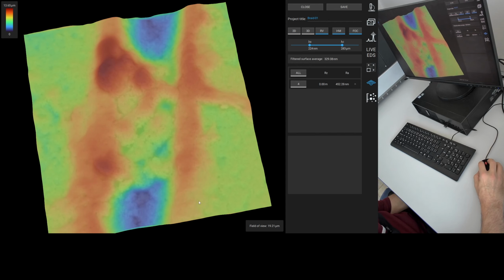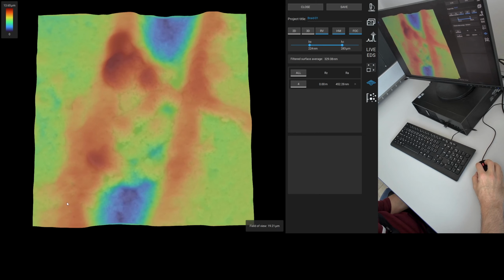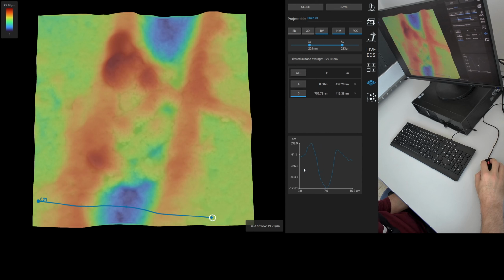So we're going to do one line across here. Yeah. We'll do from outside. You see it's thrown material up on the edge. So it's got a ridge. Okay, so that's kind of across the path. Look at that. It's gouged. My whole distance there is 15.2 microns. Half of that is 7.6. So is it 10 microns across or whatever in the middle? Maybe. That's the ridge height.